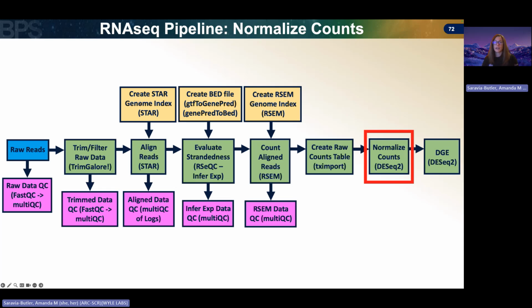And we built a STAR index with that, just organizing that sequence and annotation information to make the alignment step more efficient. We then talked about how to align those reads to your reference, and then took a look at the log files of that alignment information to see how well our reads mapped to our reference: percent uniquely mapped reads, percent multi-mapped reads, etc.